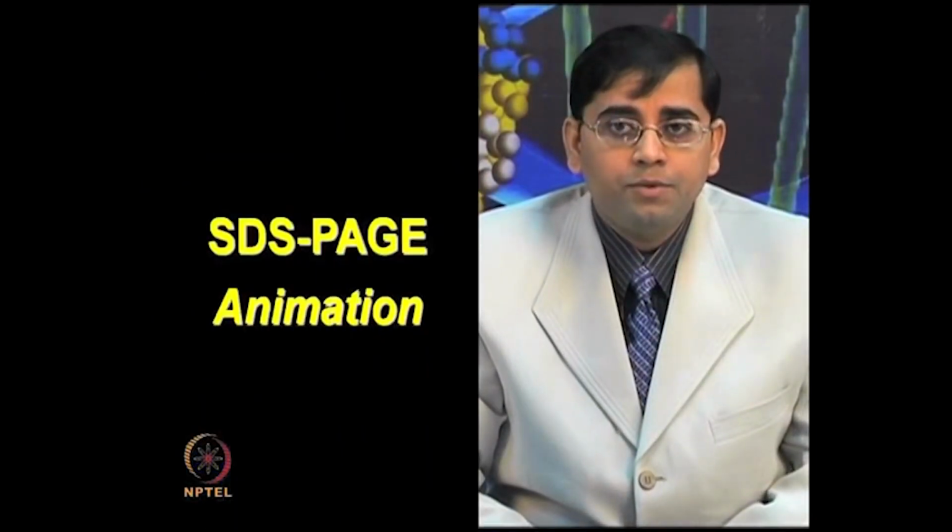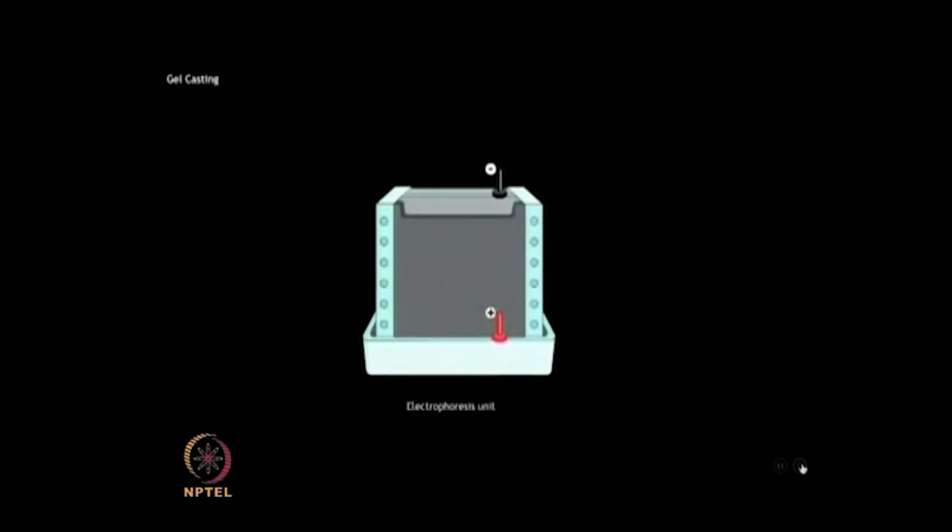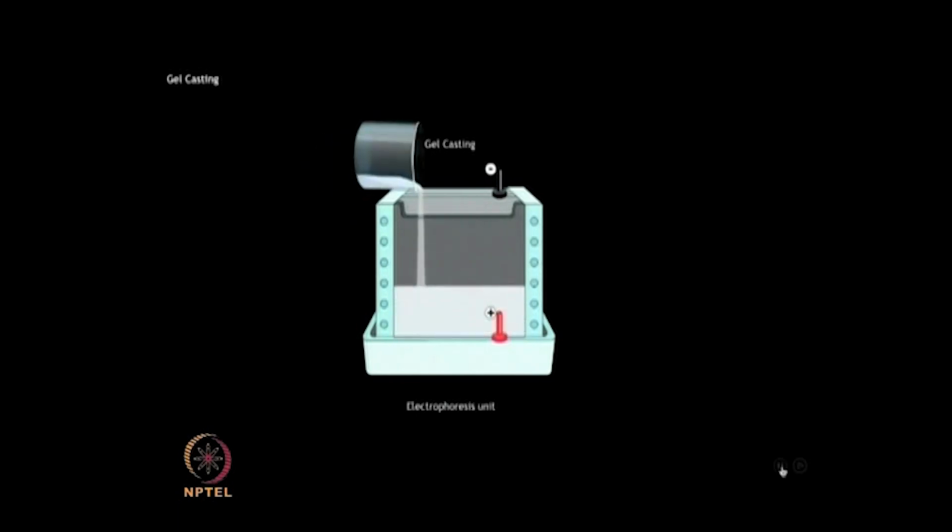I will now describe the animation and show you the steps involved in SDS PAGE. Sodium dodecyl sulfate polyacrylamide gel electrophoresis, SDS PAGE. In this animation you will see various steps involved in separating proteins based on their molecular weight.